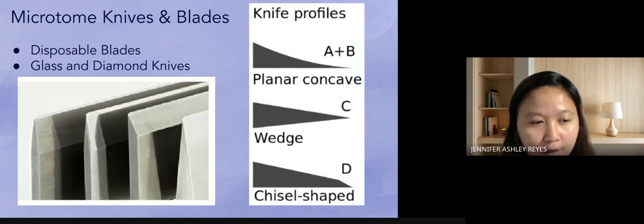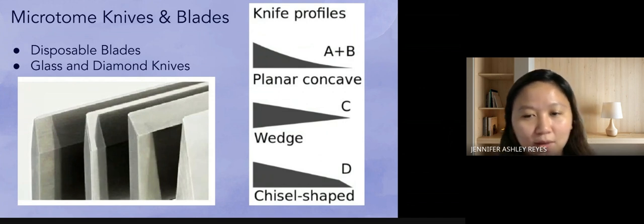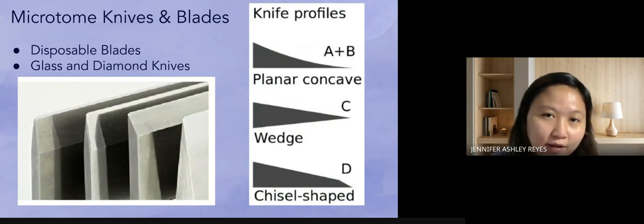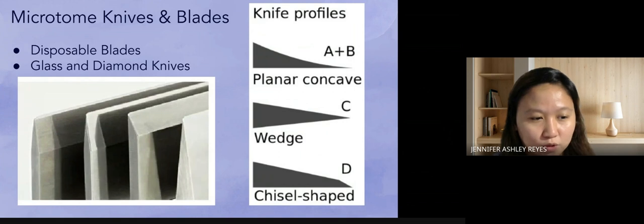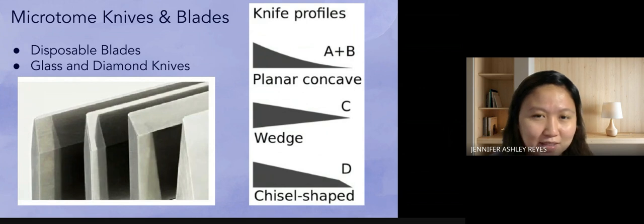So think about thickness control when you are thinking about the microtome knives. When you adjust section thickness, that's through microtome control. It affects what you see under the microscope. If it's too thick, of course, light will not pass, and if it's too thin, it's almost transparent, so you miss the structure.